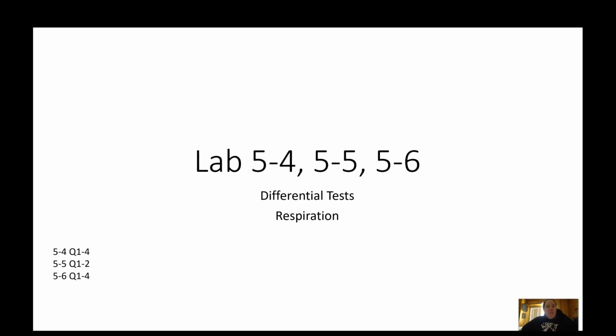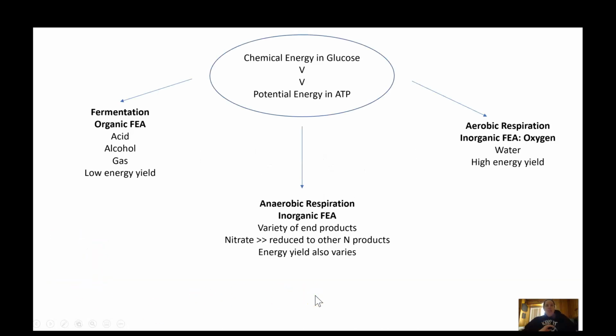And so the focus of this week's test, these 3 different experiments, is to look specifically at bacteria that have the ability to respire. So I included the questions that I think are kind of valuable for you in these 3 tests. They're right here. All right, so let's remind ourselves a little bit about what the point of respiration is and really just kind of energy processing in general.